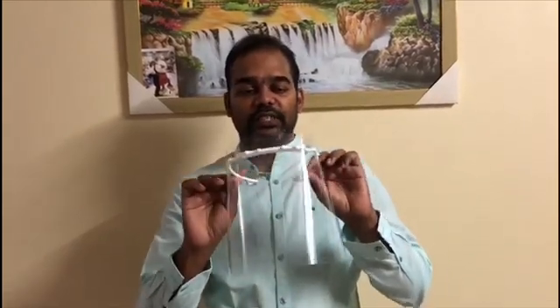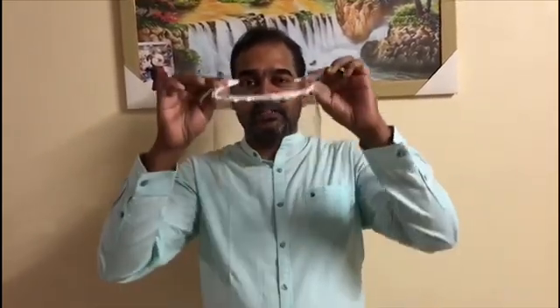That's it — the face shield is ready. Step three: using the face shield. You can place the face shield over your head and align it according to your need.